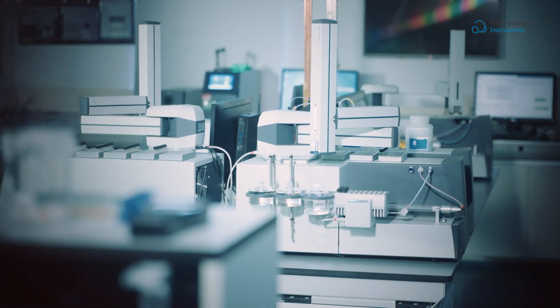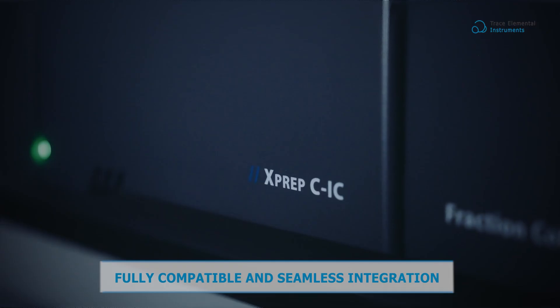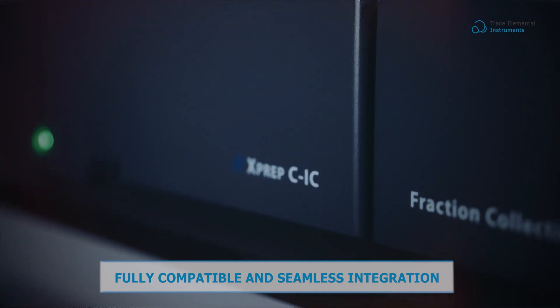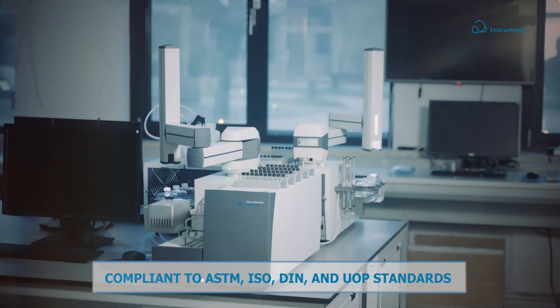Undoubtedly, the Vectra autosampler is fully compatible with a wide range of our instrumentation. It adheres to a range of essential standards, including ASTM, ISO, DIN, and UOP.